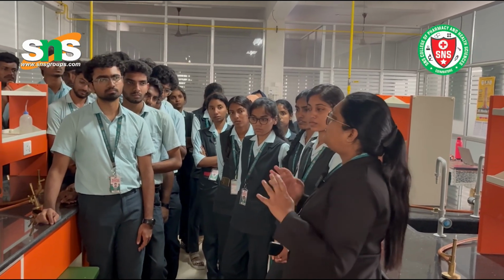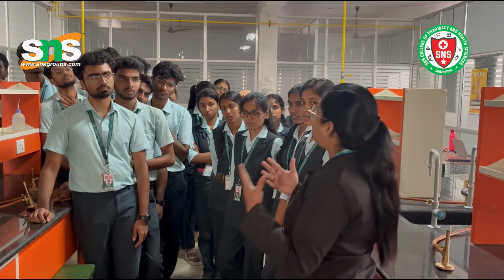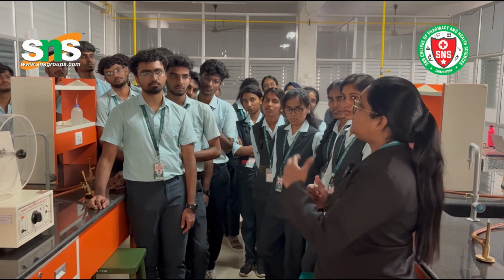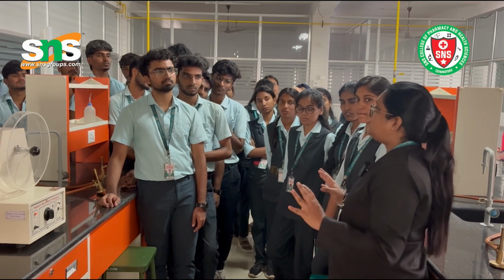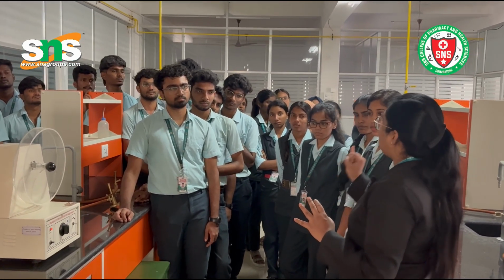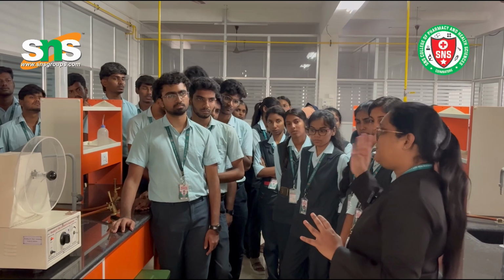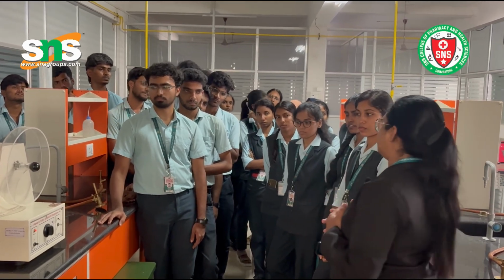Now madam, you have given an introduction about the friability test apparatus, how it works and why you have to use it. But how do you tell the DT scenario in this friability test apparatus? Guys, you know how many DT principles there are? Six. What are those? First one, empathize, second define, third ideate, fourth prototype, fifth evolve, and sixth reflection.